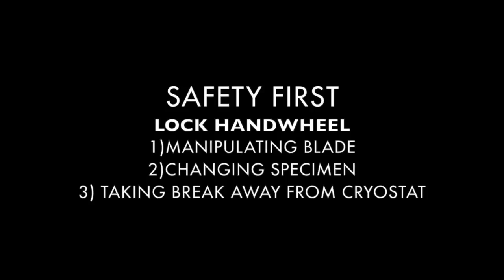Always lock the hand wheel prior to manipulating the blade, changing the specimen, or taking a break away from the Cryostat.